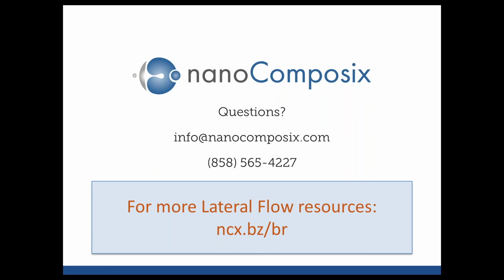Because we noticed that everybody was using solid gold spherical nanoparticles, and we had a library of 500 different sizes and shapes. And so what we did is we basically systematically went through our library of rods and star-shaped particles and different hollow particles and nanoshells. And at first pass, what we came up with was that these 150 nanometer gold nanoshells actually performed really well.